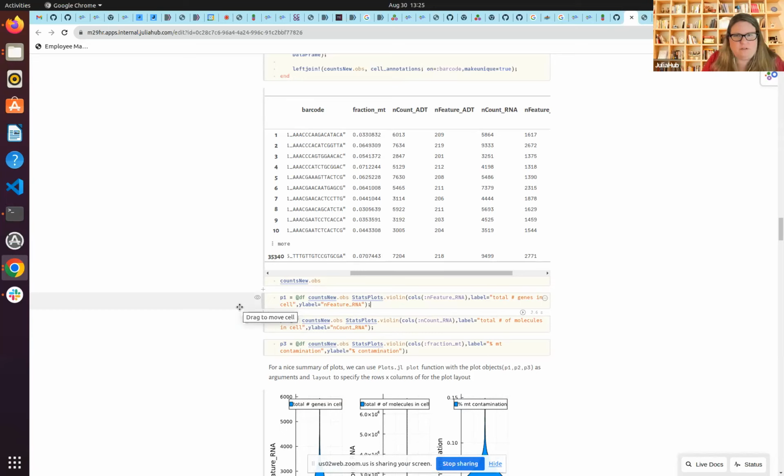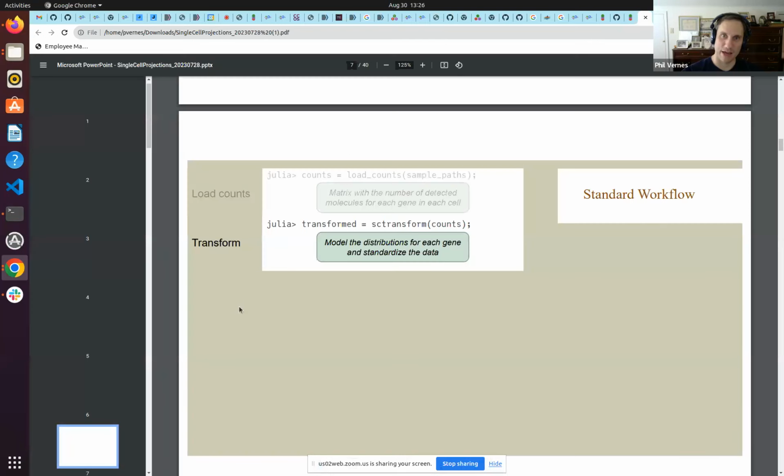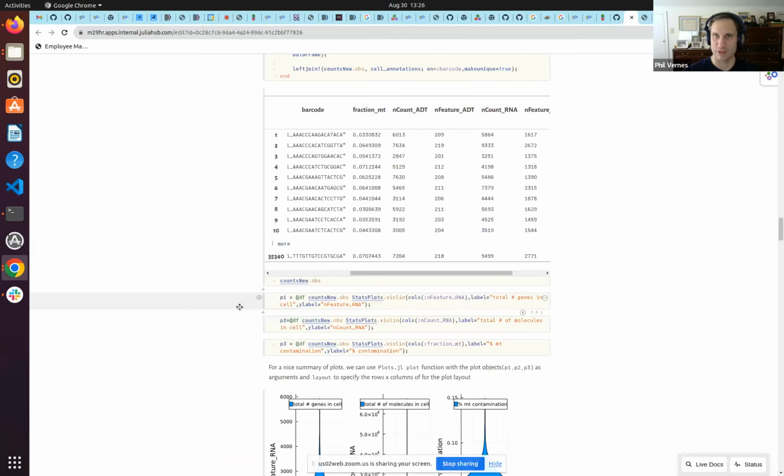There was a request to elaborate on the modeling. How is it done? Is it PCA-based embedding or something else? How do you essentially take care of the batch distinguishing? Oh, that is a detail I don't know. I know how the expression is evaluated in the matrix. I would have to go through the actual detail of the execution, but that I don't know. So that's a good question. That's very technical, unfortunately. So I don't know that.